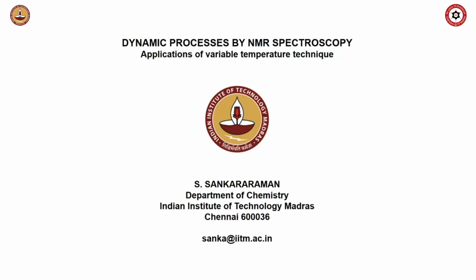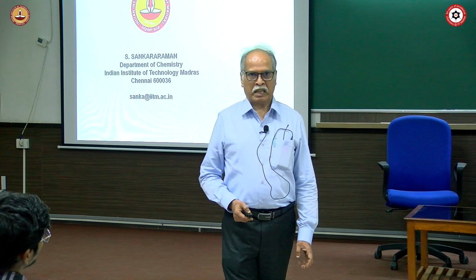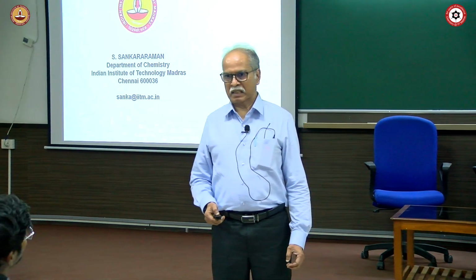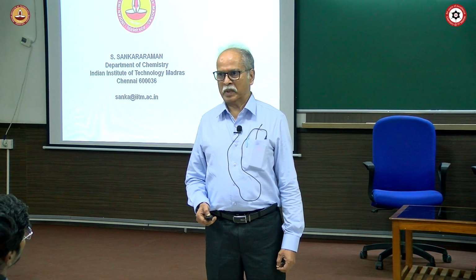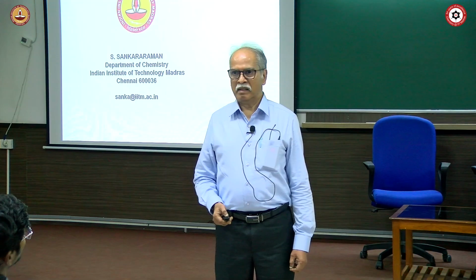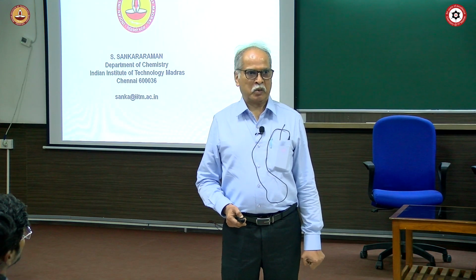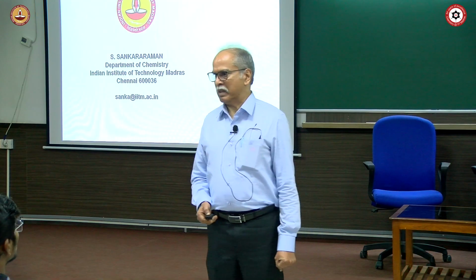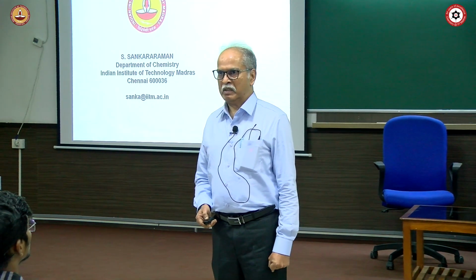When I say NMR spectroscopy, most people will talk about structure elucidation. You run an NMR spectrum and interpret the spectrum in terms of chemical shift, coupling constant, and area under the peak, and arrive at the structure of the molecule using NMR spectroscopy. How many of you have heard about NMR spectroscopy? Quite a few have heard about NMR spectroscopy. It's good.